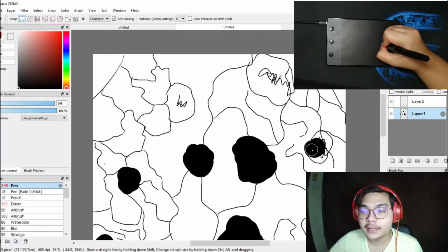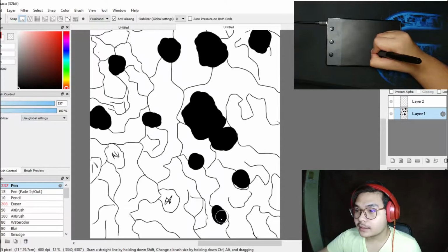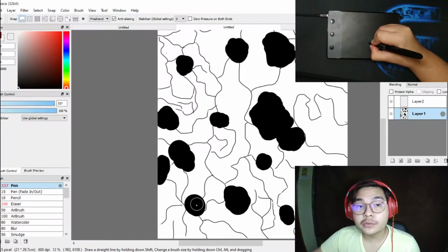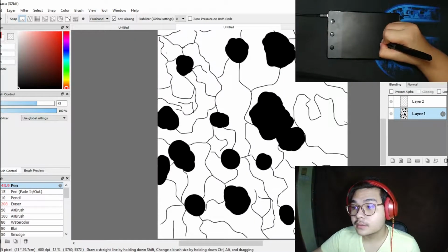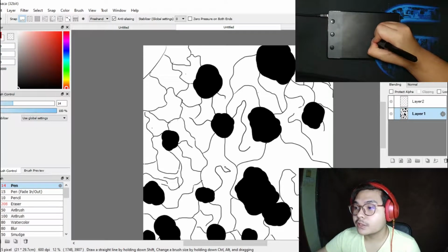So the first result under the microscope is ductile nodular cast iron. As you can see, the dark spots are graphite nodules, also known as spherulites. So, dark graphite nodules in an alpha ferrite matrix.